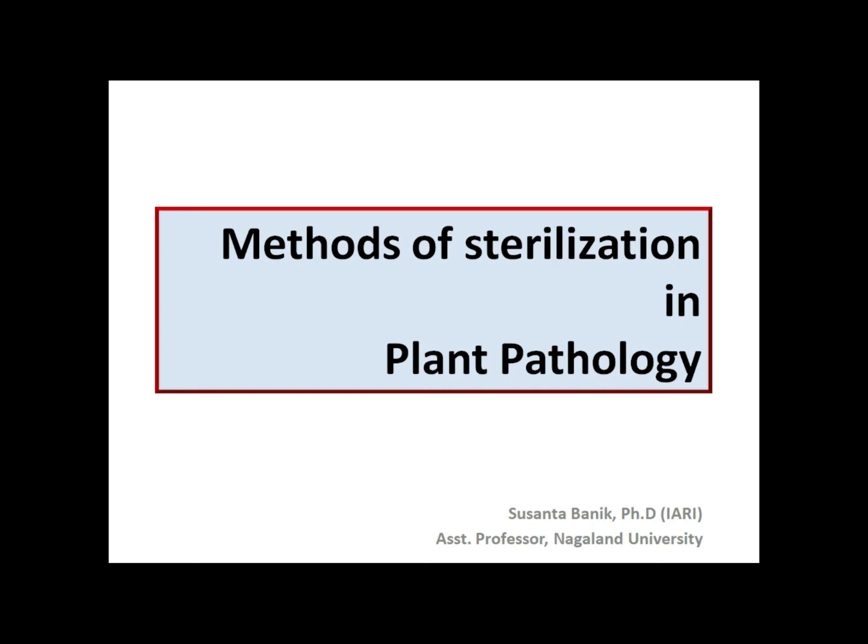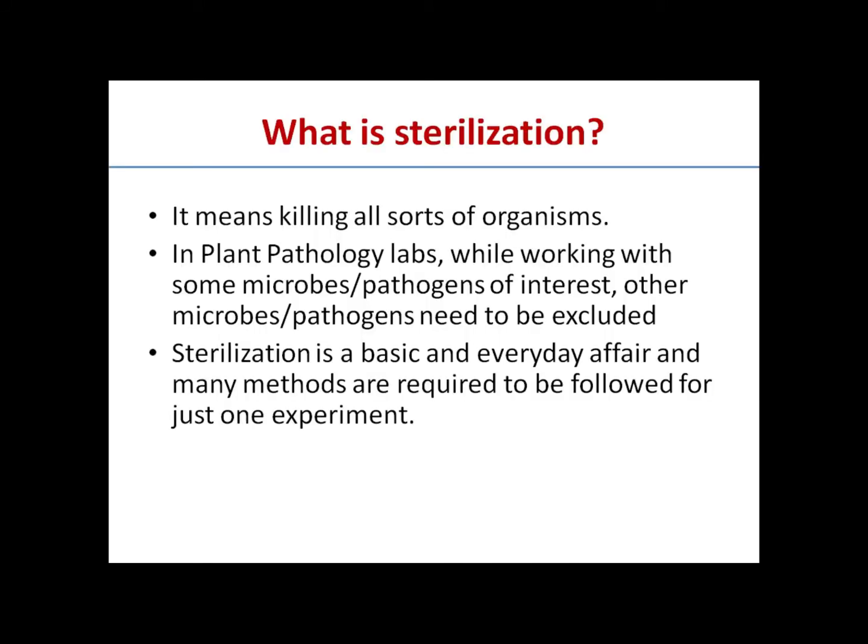When we want to make a thing or material free of microbes, sterilization is the process we follow. So, what is sterilization? It means killing all sorts of organisms.